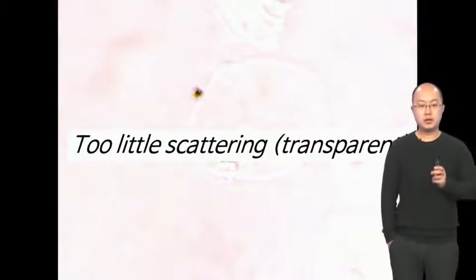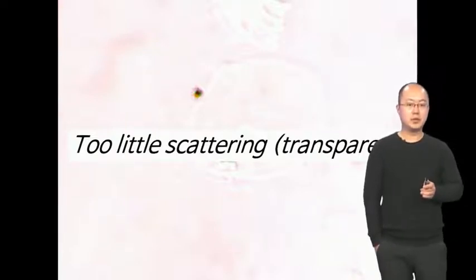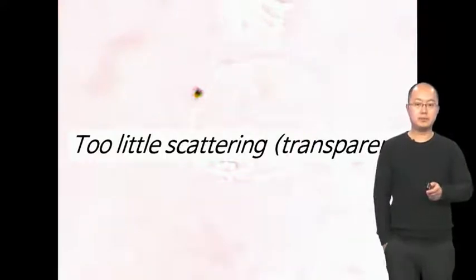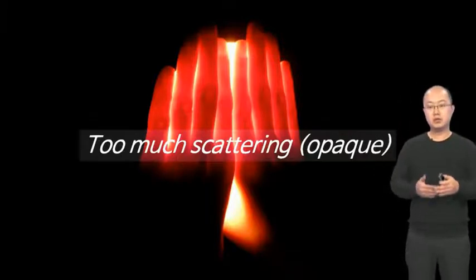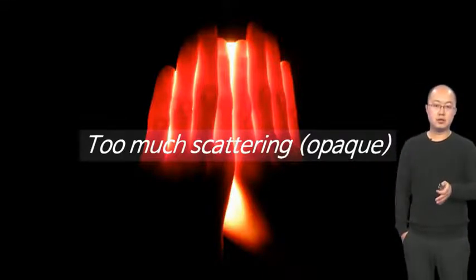So that's why it's very difficult to directly visualize an individual cell using the bright field microscope, because in the bright field microscope, imaging contrast comes from the optical absorption, which doesn't provide enough information for biological cells. However, if you think about human tissues, they are composed of multiple layers of transparent cells. They look so opaque because of too much scattering. So controlling this light scattering is key for imaging individual biological cells and imaging through turbid human tissues as well.